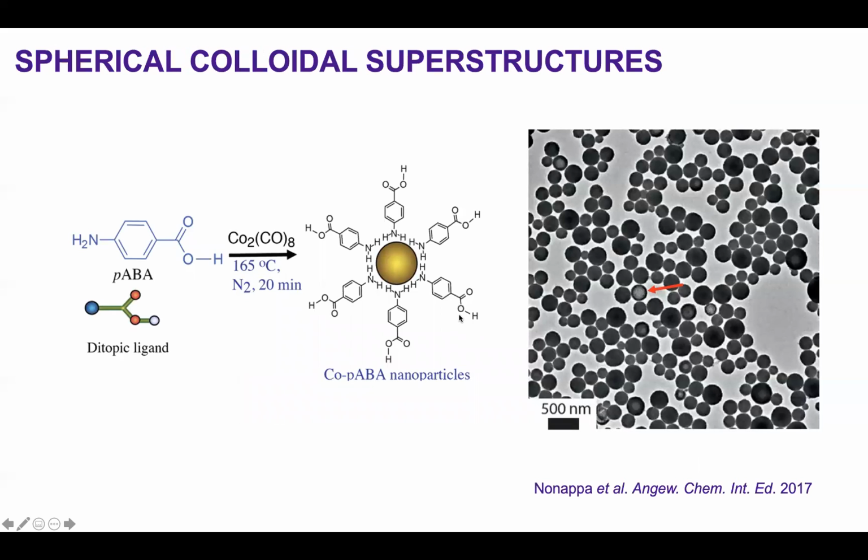So we can use it to determine the structure and arrangements of the atoms. We can go beyond that and distinguish if you have a heterogeneous population in the same synthesis of nanoparticles. This is a cobalt nanoparticle synthesis. It forms nanoparticles that assemble into a higher structure.